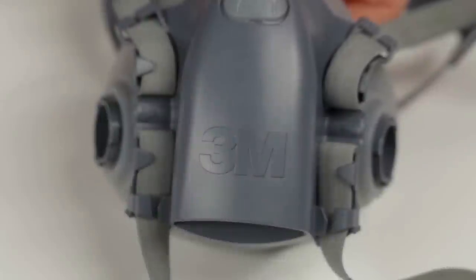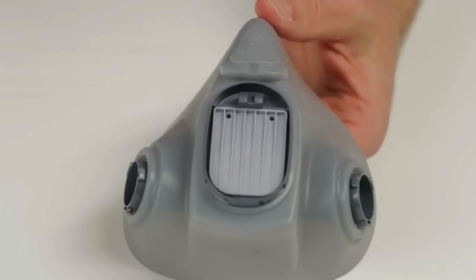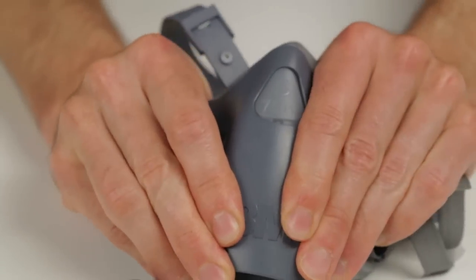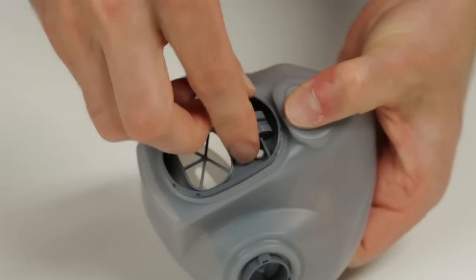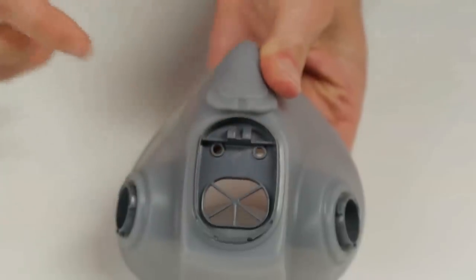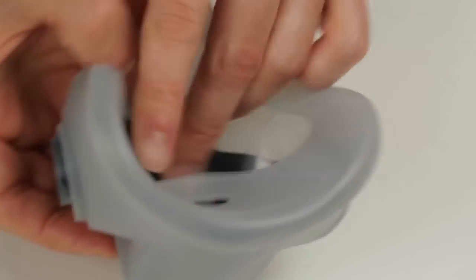To remove the head harness assembly, pull it away from the face seal by grasping the edges and pushing on the silicone triangle with your thumb. To replace the head harness assembly, align the parts and push them together firmly until two clicks are heard. To remove an existing exhalation valve, remove the head harness assembly as before, then grasp the valve and pull each valve stem out from the valve seat. Inspect the valve seat to make certain it is clean and in good condition. To replace the exhalation valve, insert the stems into the two holes until they are visible from inside the face piece, and then pull the stems through until the valve is securely seated.